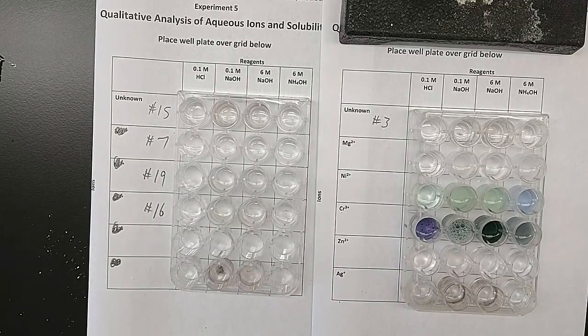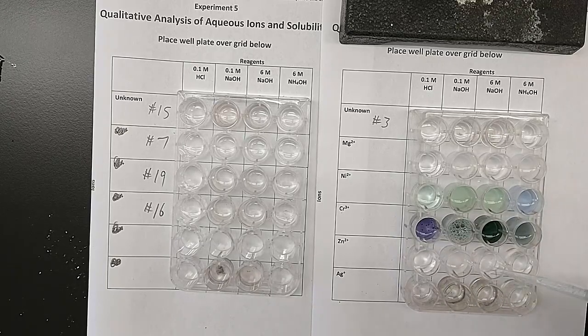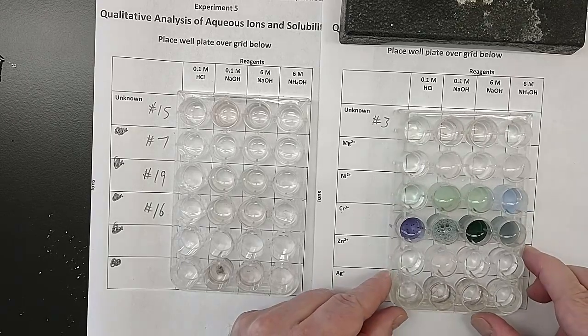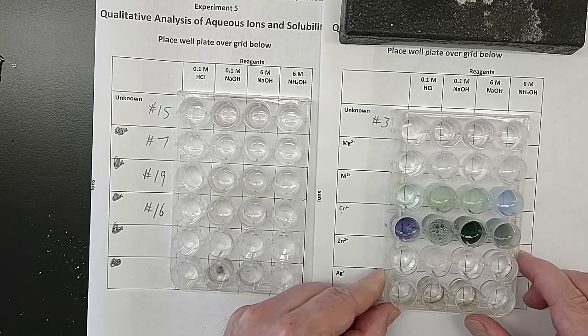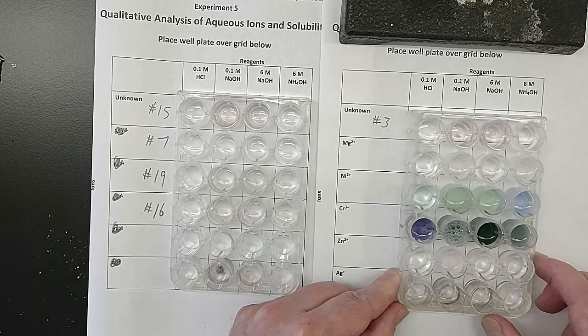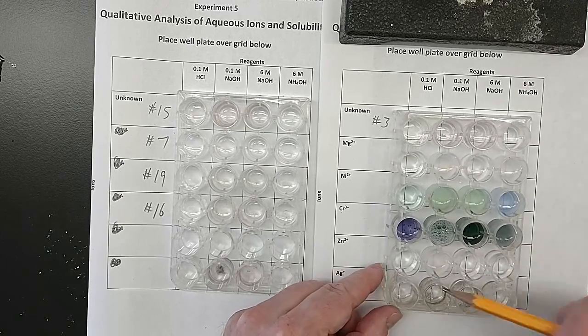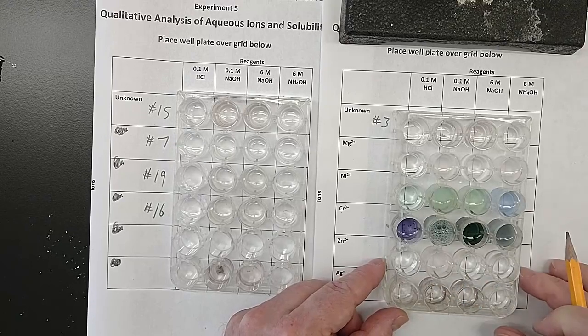Gonna stir each of these. Just moving it over so I can look at the line of the grid through it to see if I can see through it or if it's cloudy. The hydrochloric acid looks unchanged. It's still clear and colorless. So that's what I'm recording on my data sheet.